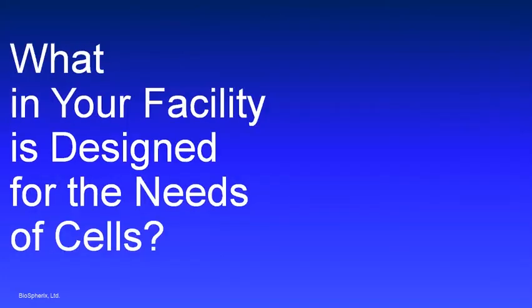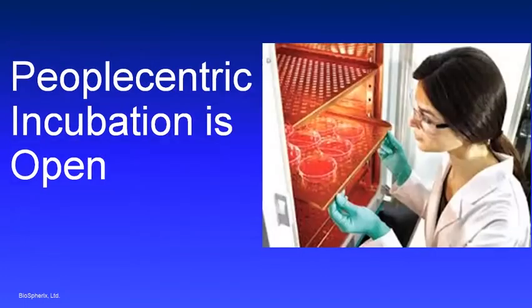I'm going to ask you, what in your facility, what did you see there that is actually designed for the needs of cells rather than for the needs of the people that work in the laboratory? A lot of you might have thought of your traditional room air cell culture incubator. It seems like it's set up for the needs of the cells, but really when you think about it, it's designed for the needs of the people in the lab more than the needs for cells. I mean, it's easy to get your hands in there. It's easy to get your face right in there. But we all know that this is a terrible environment for cells.